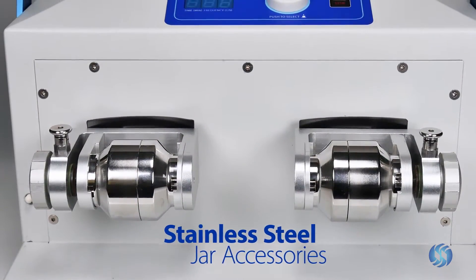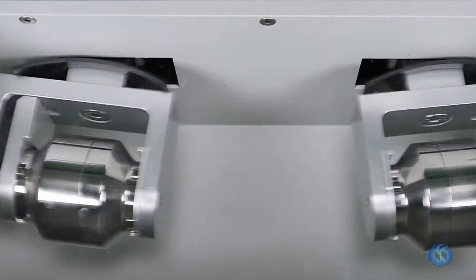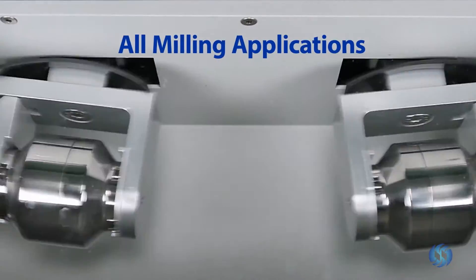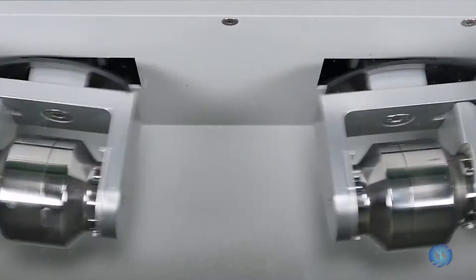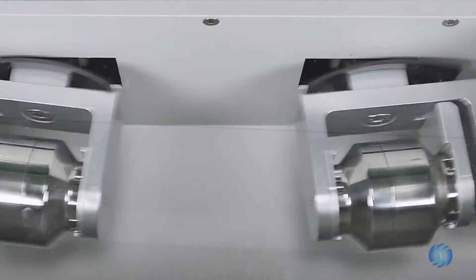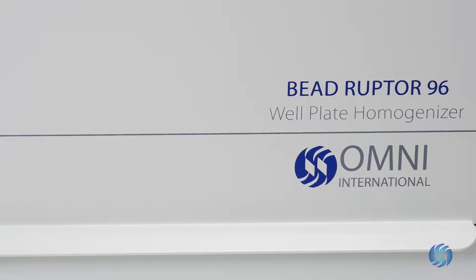When equipped with stainless steel jar accessories, the Beadruptor 96 is able to perform all milling applications including dry grinding of grains, powder particle size reduction, dissociation of plastics, plants, seeds, paper products, and drugs.